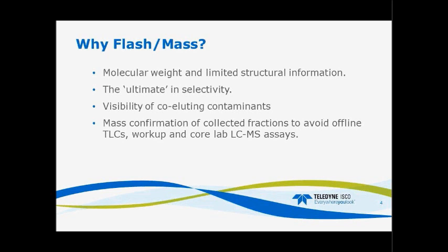It provides the ultimate in selectivity. If you're an organic synthesis chemist, you have a target compound that you're trying to synthesize. You know what the mass of that compound is going to be. And by using a mass spectrometer as the detector, you can simply program the mass spectrometer to collect only that mass and everything else be shunted to waste.